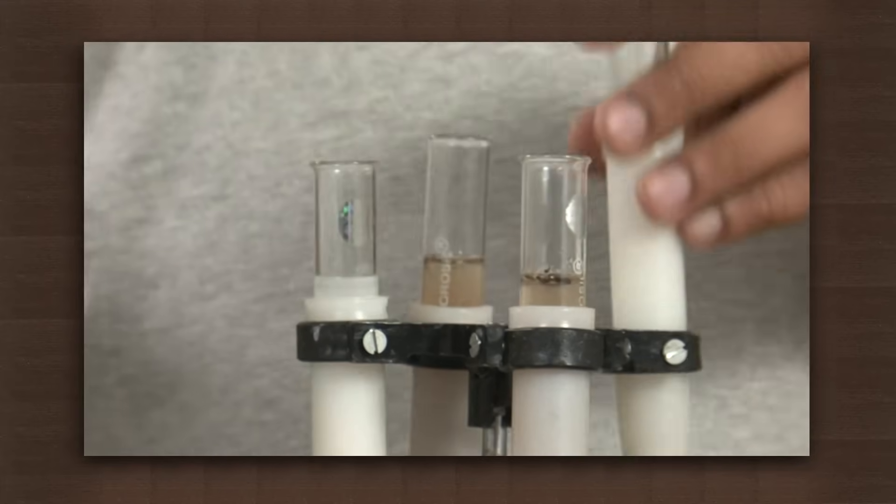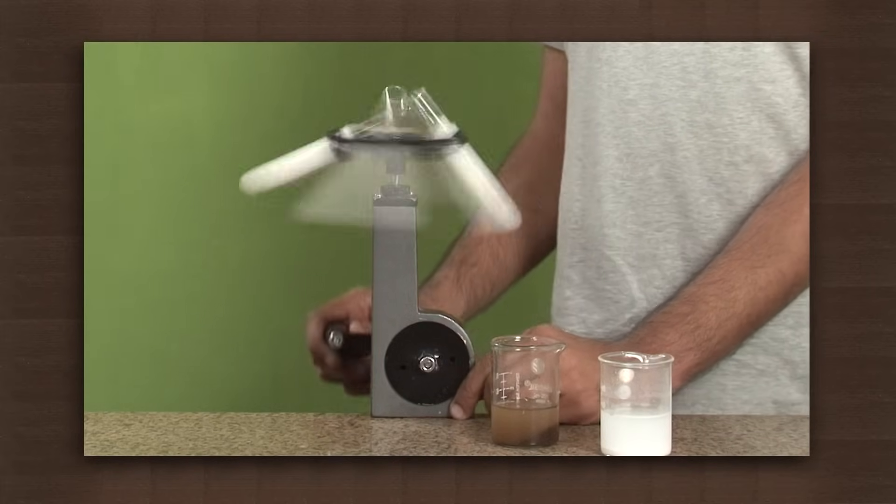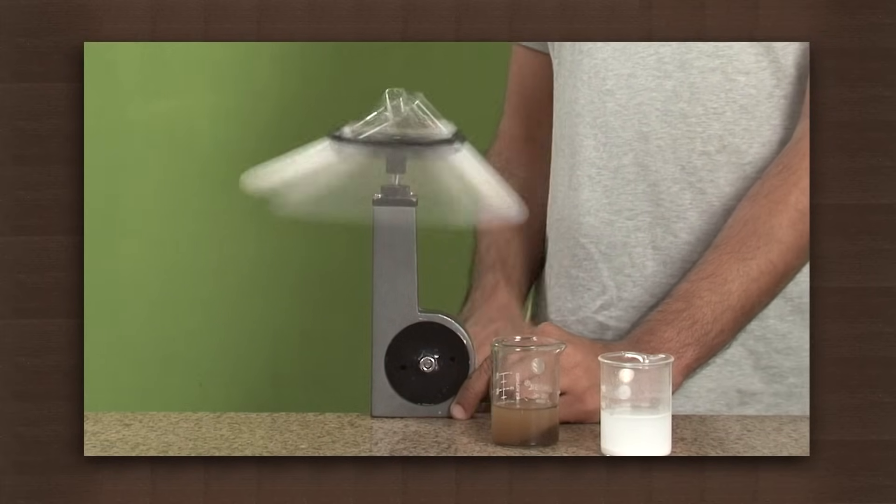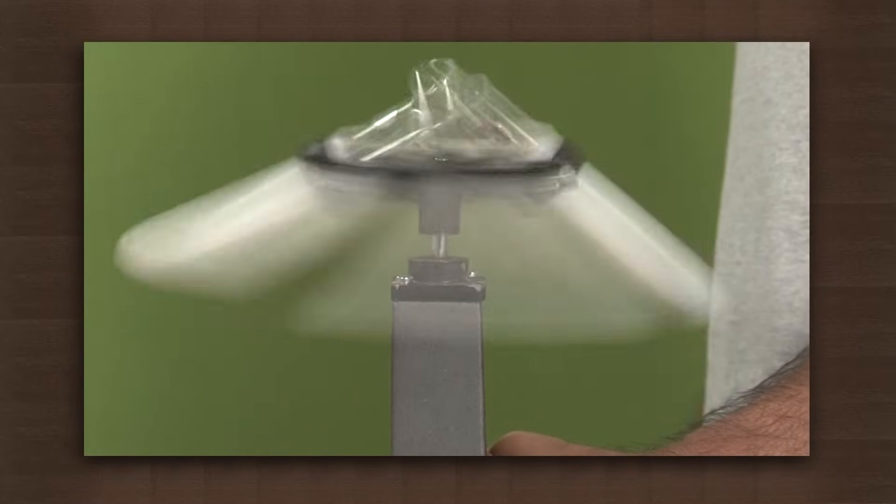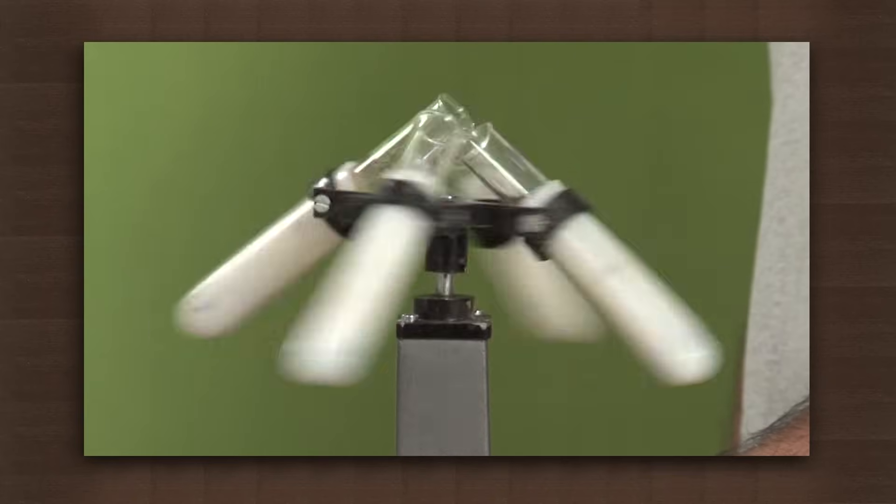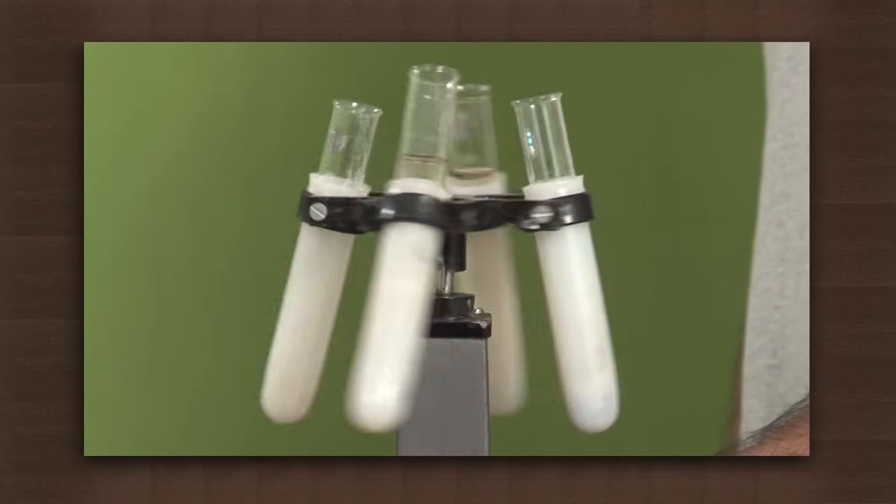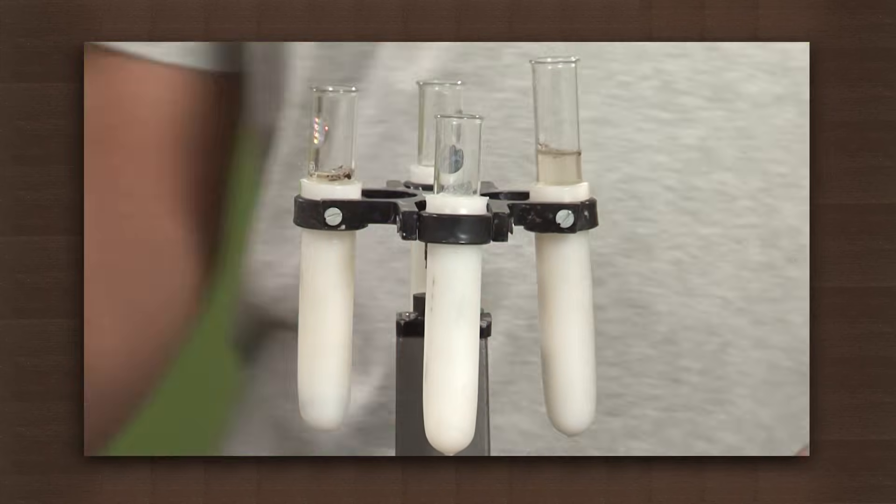Rotate the machine fast for a few minutes. Stop rotating. Remove the test tubes and observe.